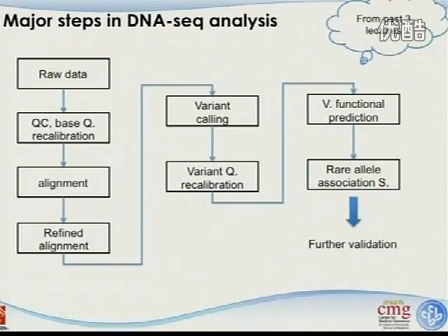If you see the variation all happens in one strand rather than both of them, and if it is DNA sequencing, you may have a higher likelihood that it's a false alignment and there's some kind of artifact there. So doing the quality recalibration is a very critical step, and I'm happy to see that one of the groups picked the project and further discovered this part, and that is very nice.